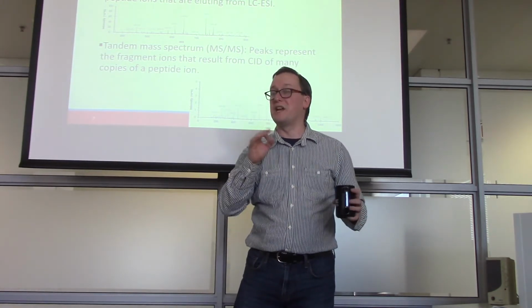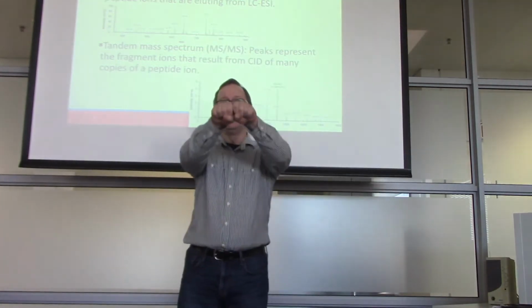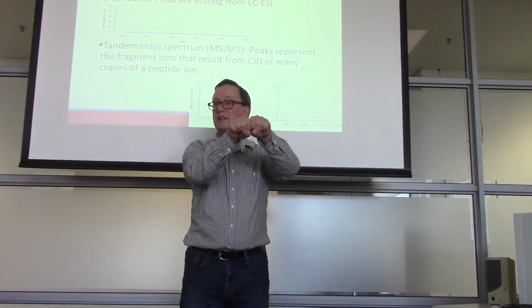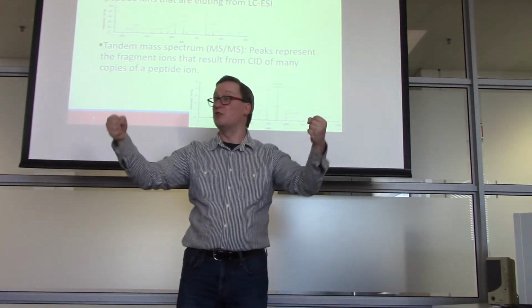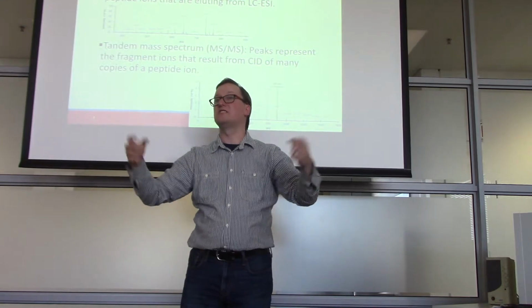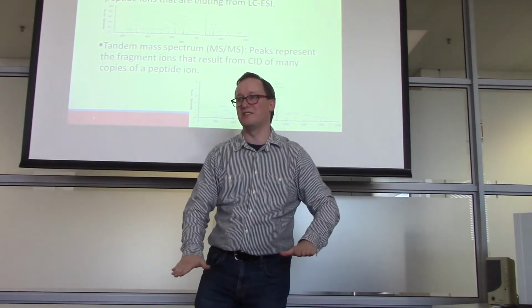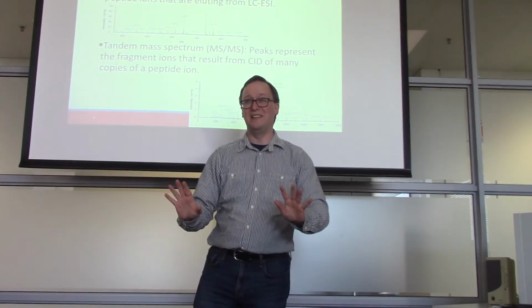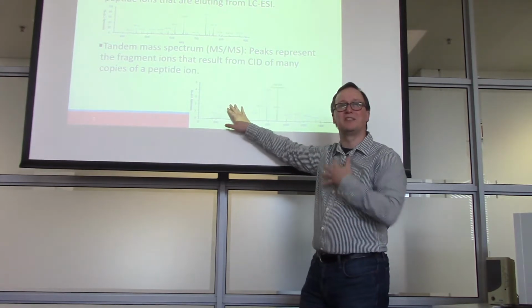What we did was break apart charge. So imagine that you've got a peptide that's carrying around 2 protons quite happily. If you break a bond, it may be that one proton goes with either side, and so its mass to charge value increases because its charge has decreased. Everyone get that? It's a little counterintuitive.